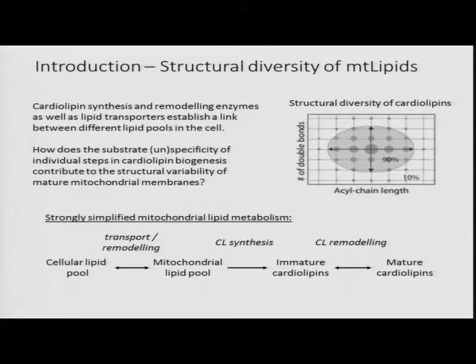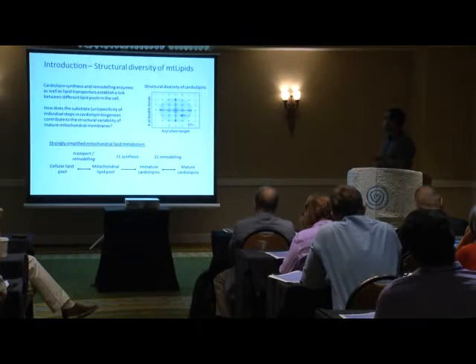And for studying what is affecting this gain of specificity, for example in different tissues, of course, you need a methodology in which you can, as well as possible, assess the structural diversity within these different lipid pools. And this is what I started at the beginning of the year, to establish a method for that, and what I want to present today.